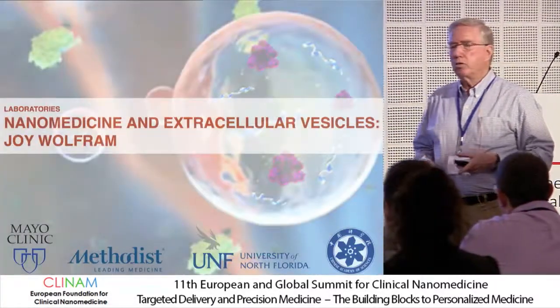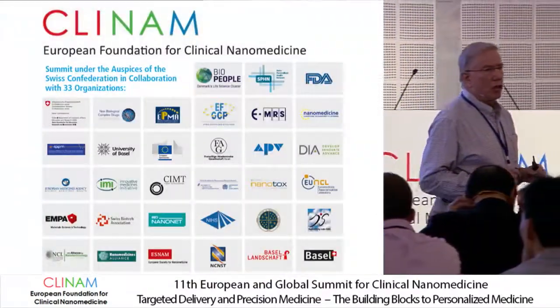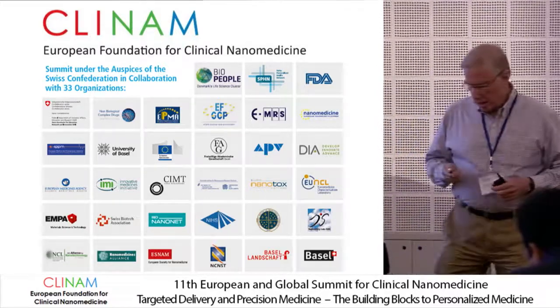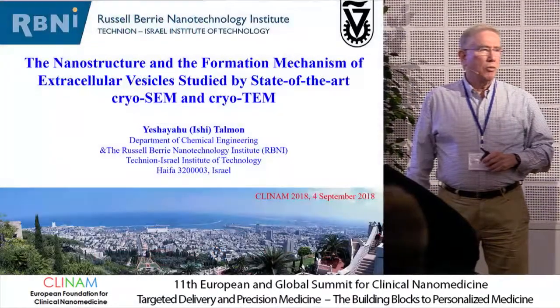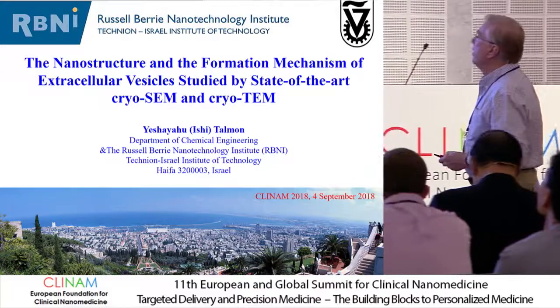What I would like to do this morning is really to give you the very essence of how we can use electron microscopy to image extracellular vesicles and also to track how they are formed from the cell.